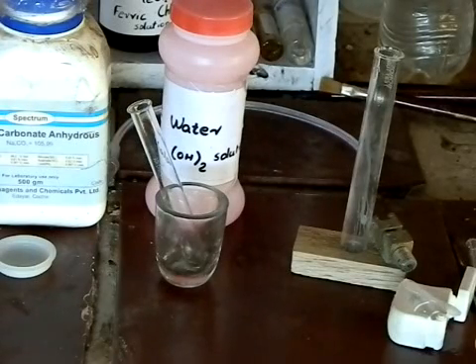Hi, YouTube. Welcome to another video from LabFund. In this video, we will be testing carbon dioxide along with its preparation.